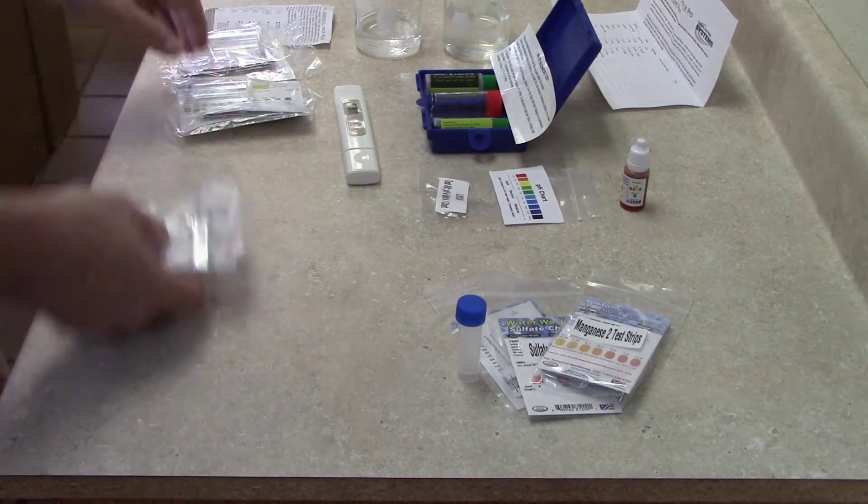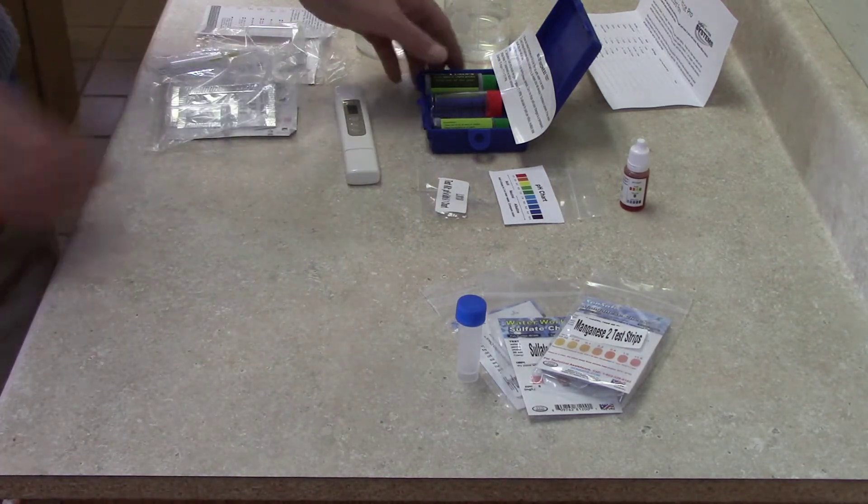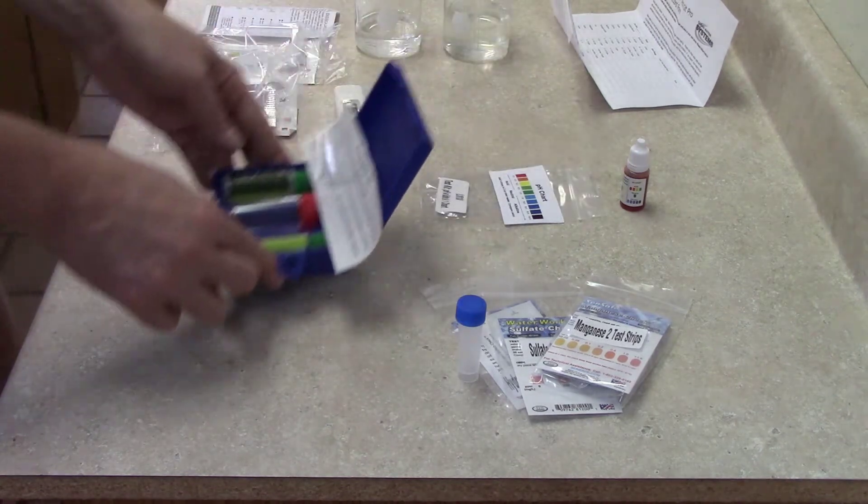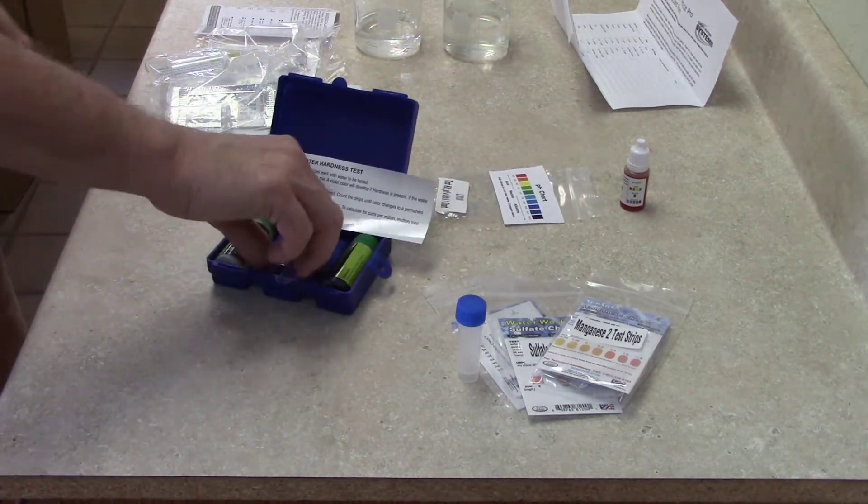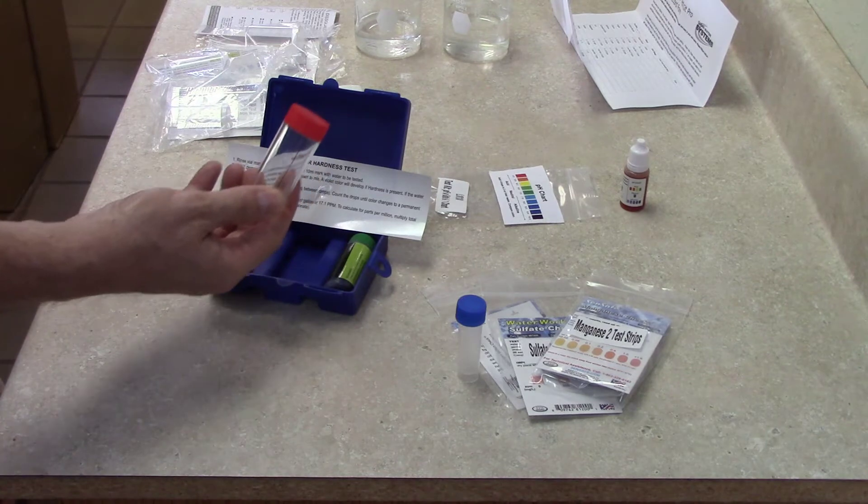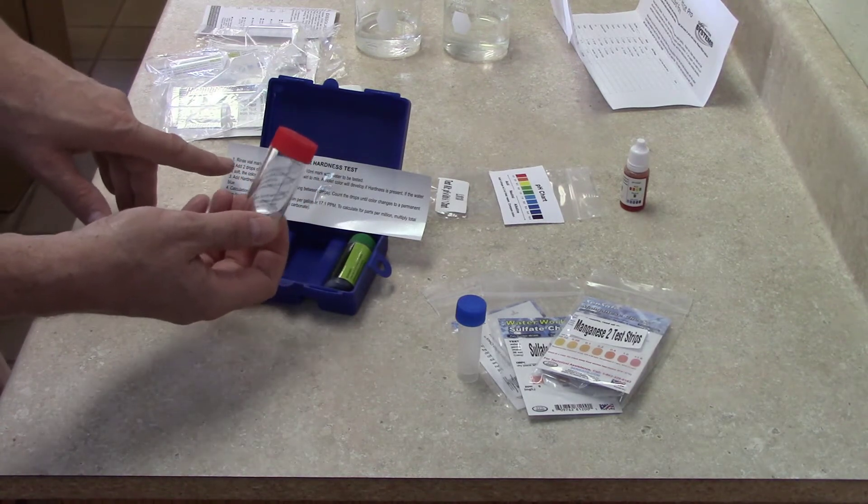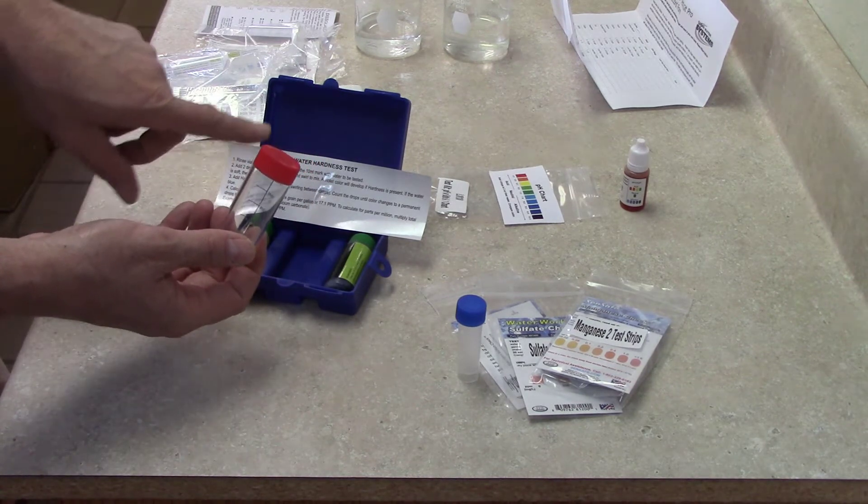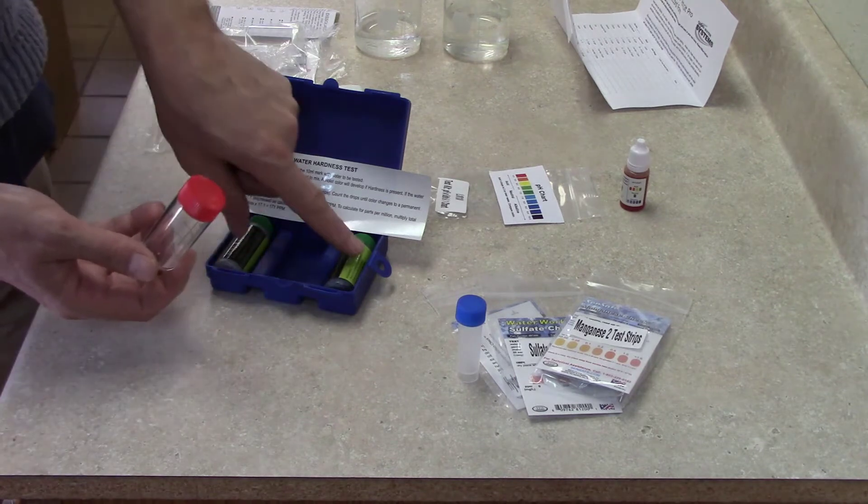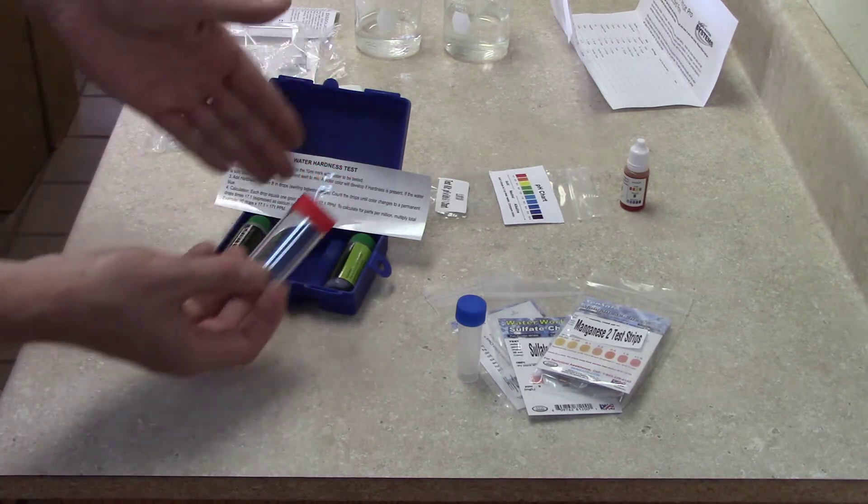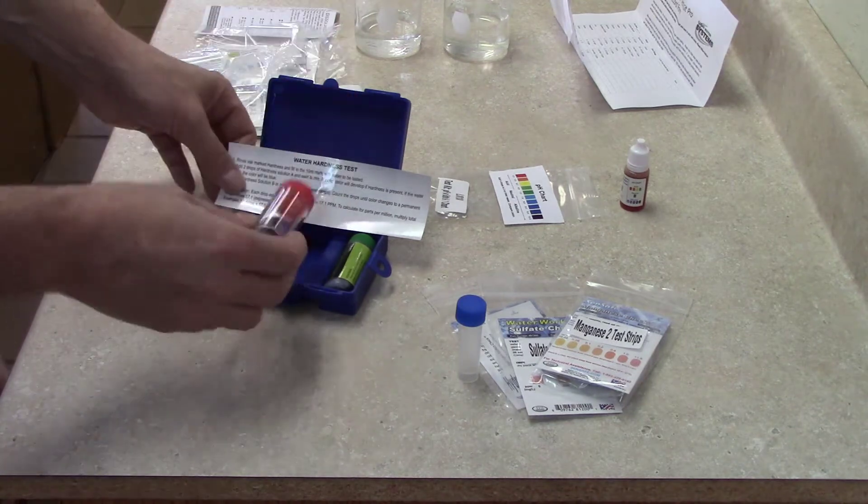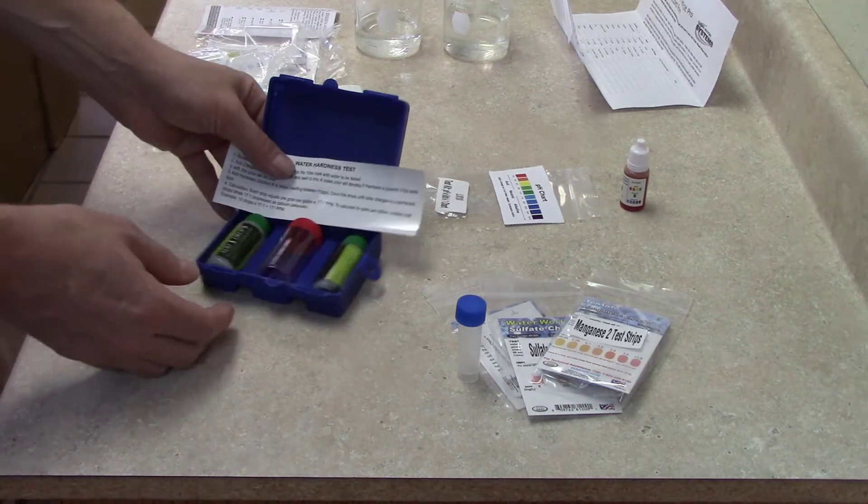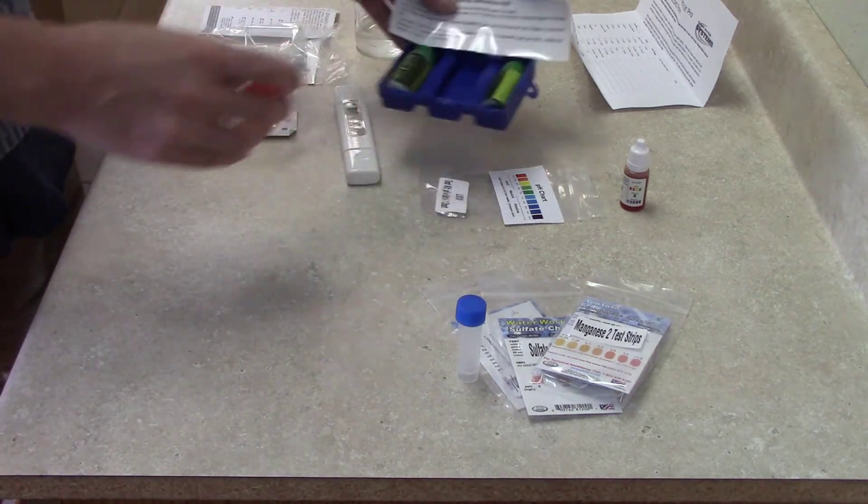Then we have the water hardness test kit, which uses drops. It's got the vial in there. You add some water, then add drops of one solution, wait a bit, then start adding drops of another. Follow along with the instructions and that'll determine your water hardness.